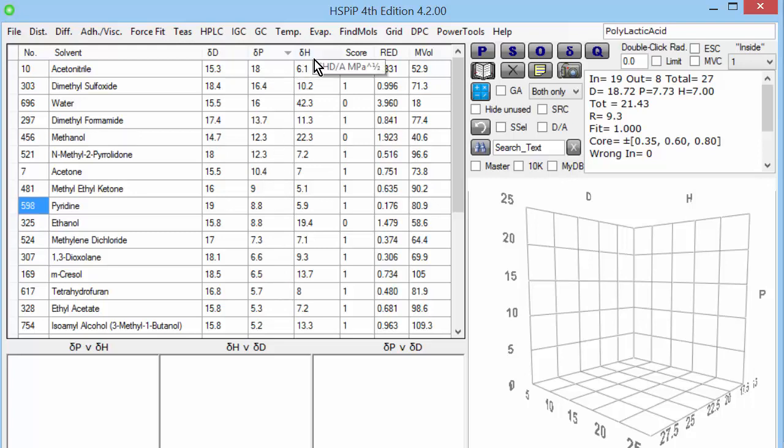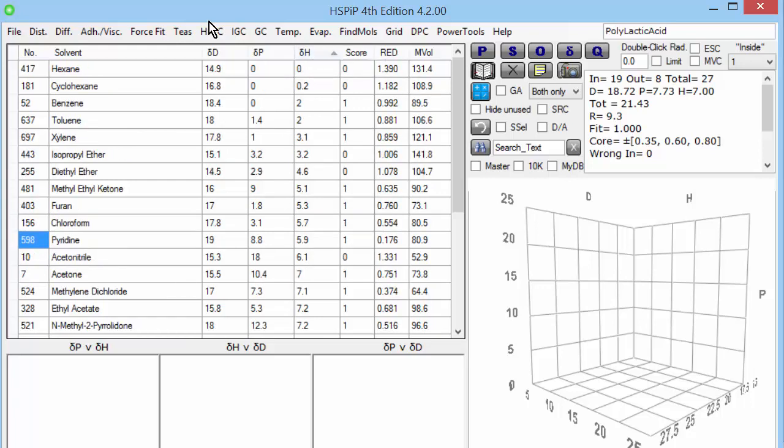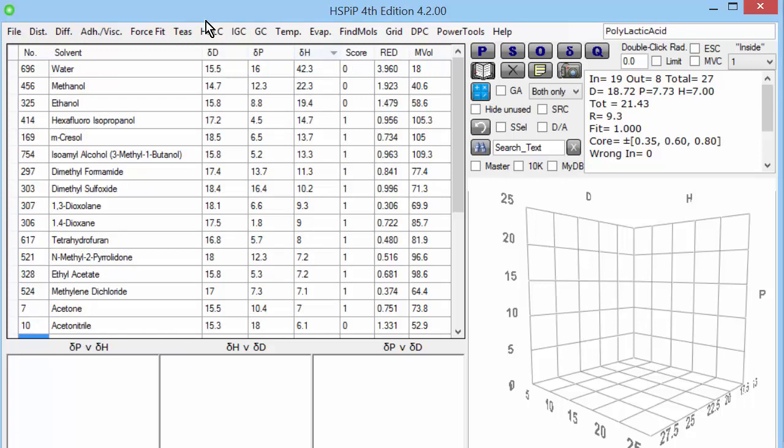The third parameter is DH, which is hydrogen bonding. And again, if we sort, then hexane has none of it. And at the other extreme we have water with lots of it, methanol with plenty of it, ethanol with somewhat less. Because the extra CH2 group going from methanol to ethanol dilutes the amount of hydrogen bonding.